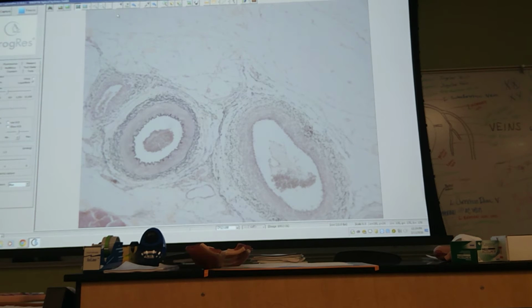Then they may get specific, you know: identify this tan band. Smooth muscle. That layer is part of what major layer? Tunica media. Those are the types of questions you will probably encounter. See how they do it? First time.